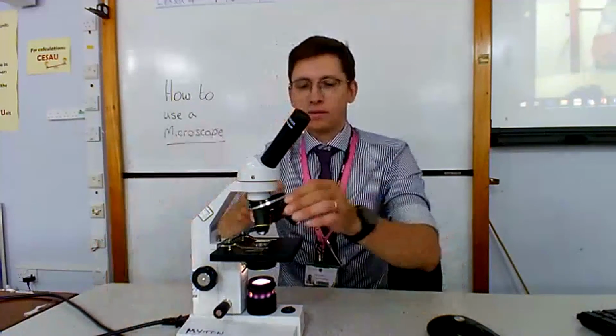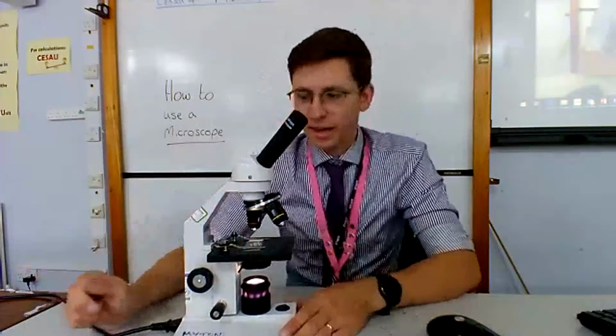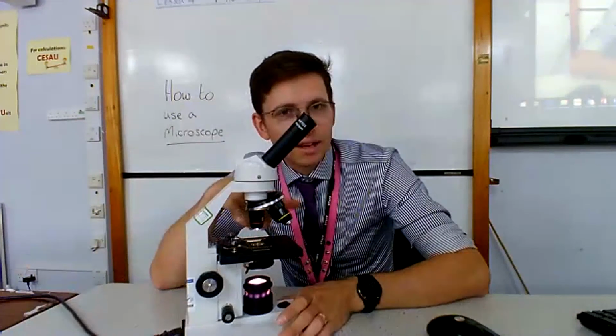Okay, so how do we use a microscope then? Well, it's very simple. We're going to use a few steps, and it's the same every single time. Doesn't matter what you're looking at, it's going to be the same. So I've selected the smallest objective lens.